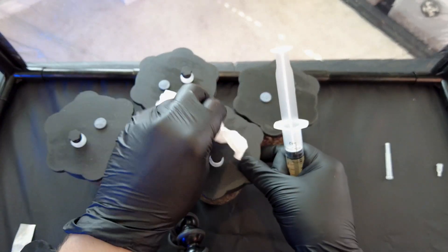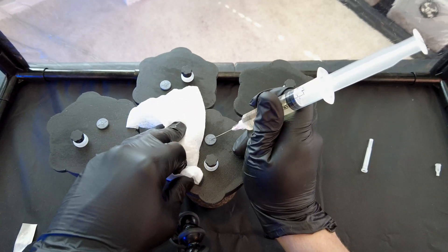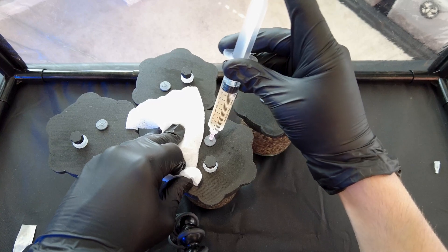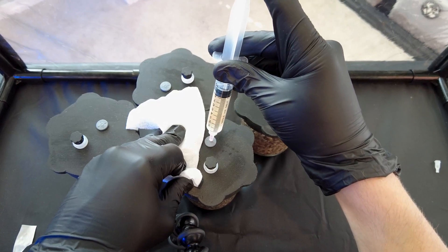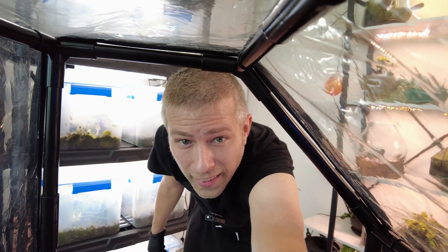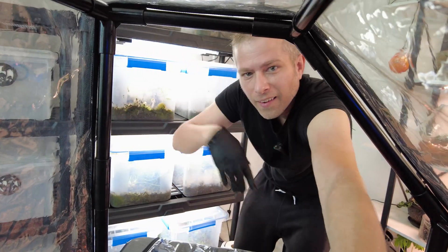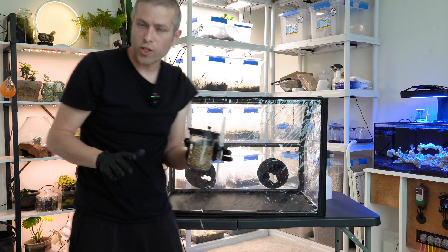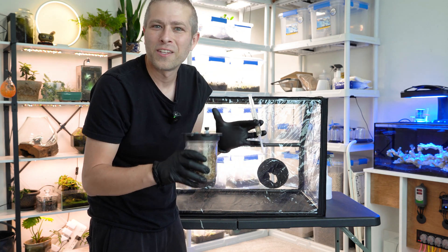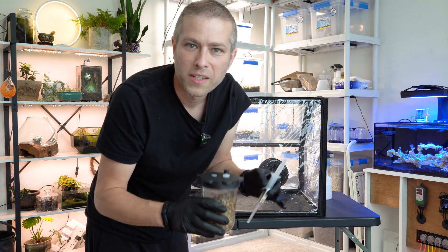Let's do number two — again, wipe down the hole, inoculate, drive about a cc, and pull it out. With our last jar, I'm going to show you one more technique in case you don't have your own sterile bubble, so you know you can still inoculate and impregnate grain jars on your own — it's just a little bit more risky.